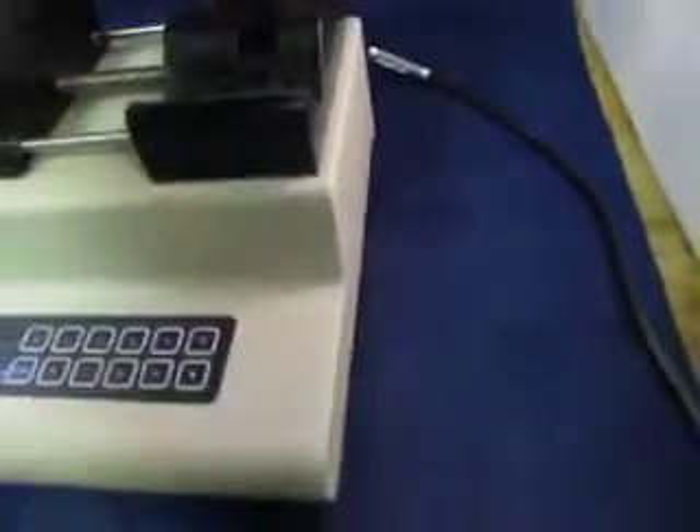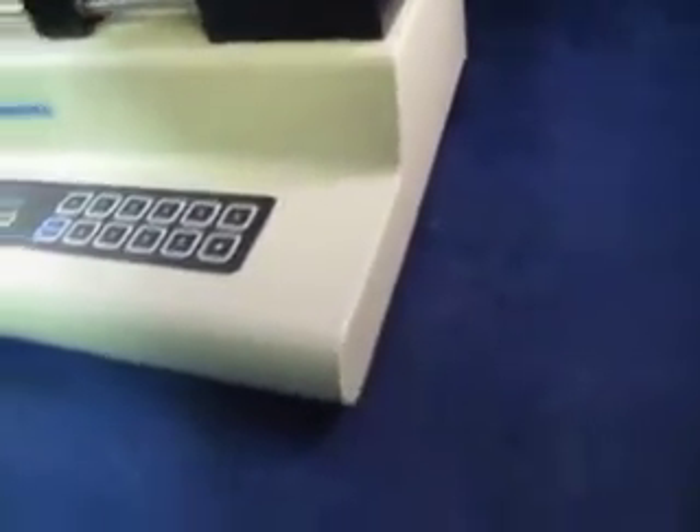Pretty nice piece of equipment. It's a model 780-200. It's for research only, not for clinical use.